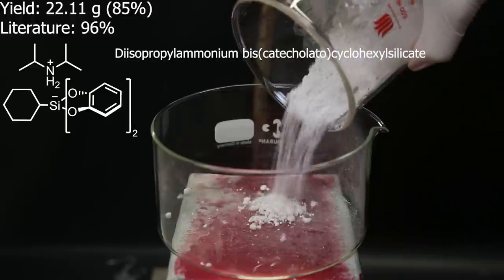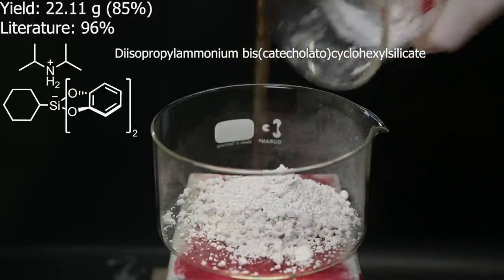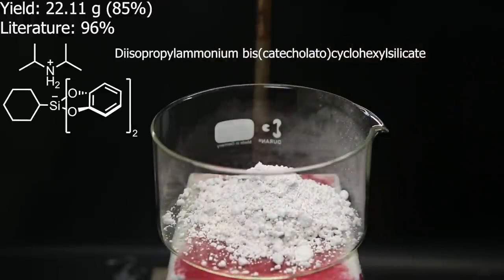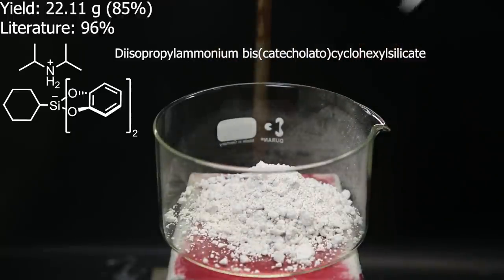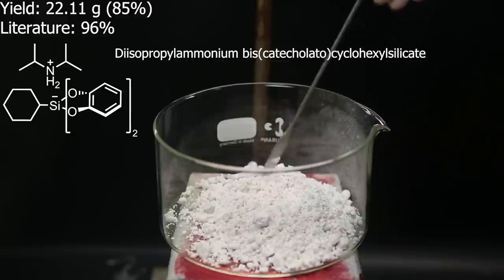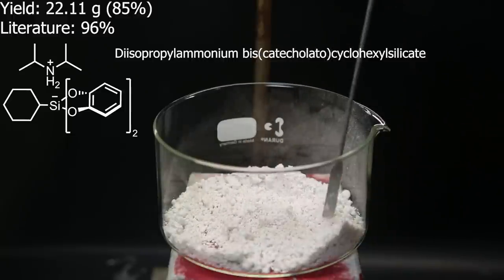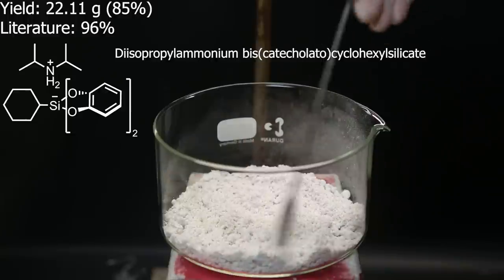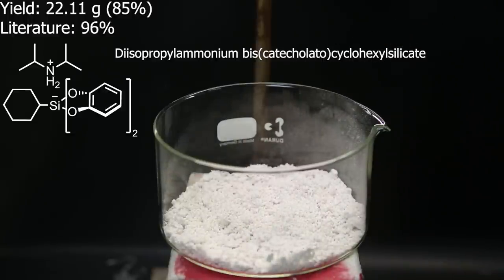After that, I am left with 22.11 grams of diisopropyl ammonium bis(catecholato)cyclohexylsilicate as a dry white powder, which is a yield of 85%. The literature had a yield of 96%, but they restarted the reaction like 4 times, and I didn't care to waste my time doing that for such a small difference. So now that the reagent has been made, I can move on with preparing the catalyst for the photoredox reaction.